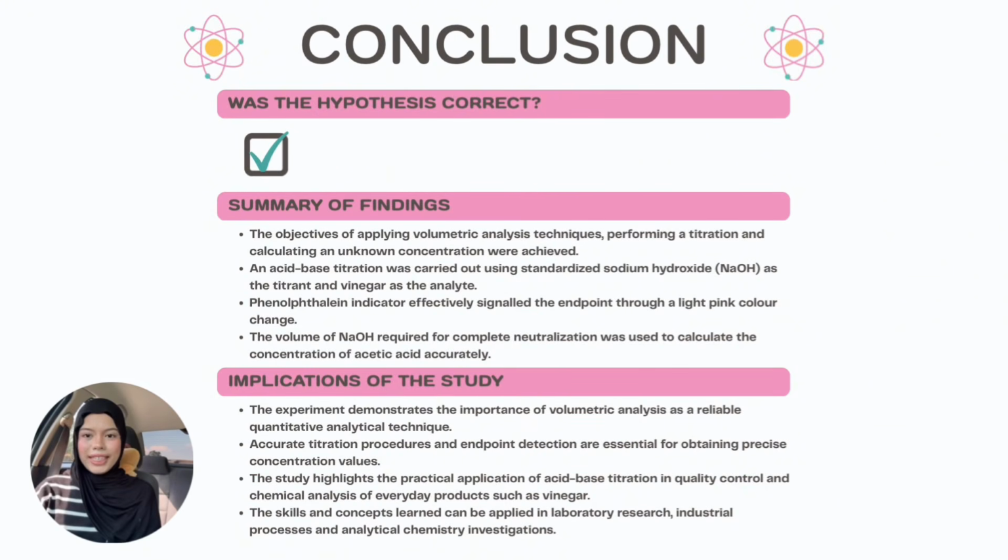Overall, volumetric analysis is a reliable and widely used analytical technique that depends on accurate titration procedures and precise endpoint detection. Its applications extend to quality control, food analysis, pharmaceutical testing, environmental monitoring, and many other areas of analytical chemistry, making it an essential technique for both scientific research and industrial practice.